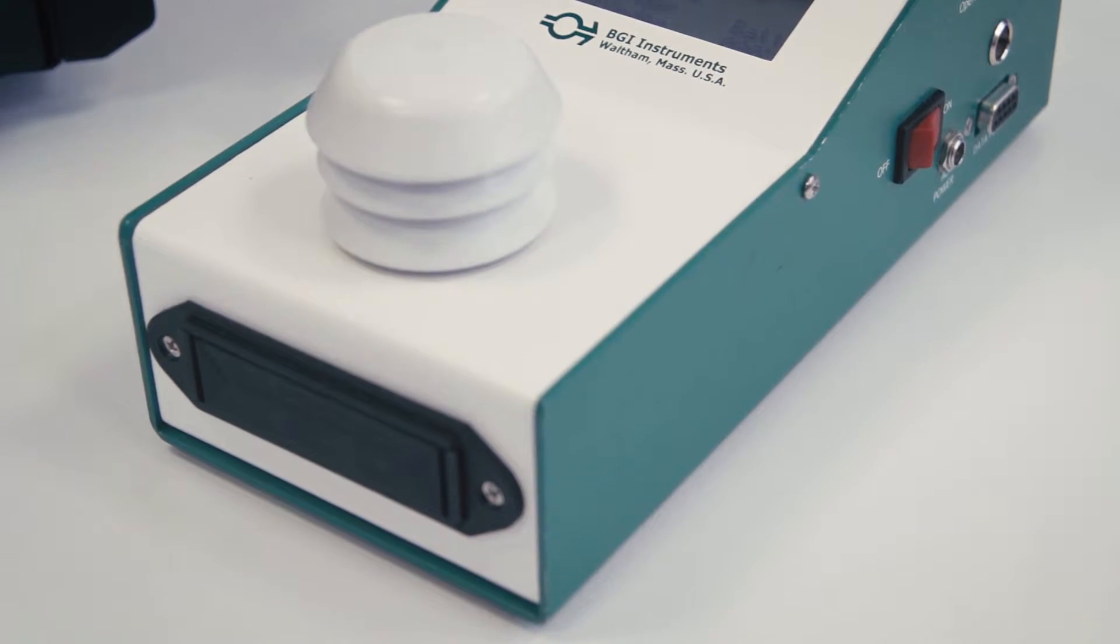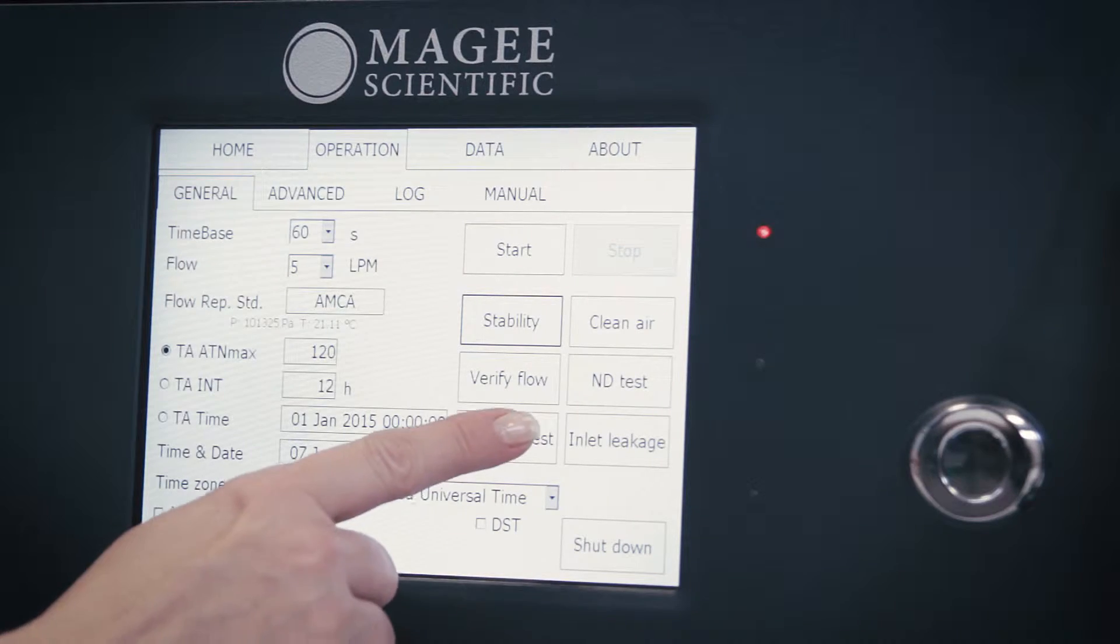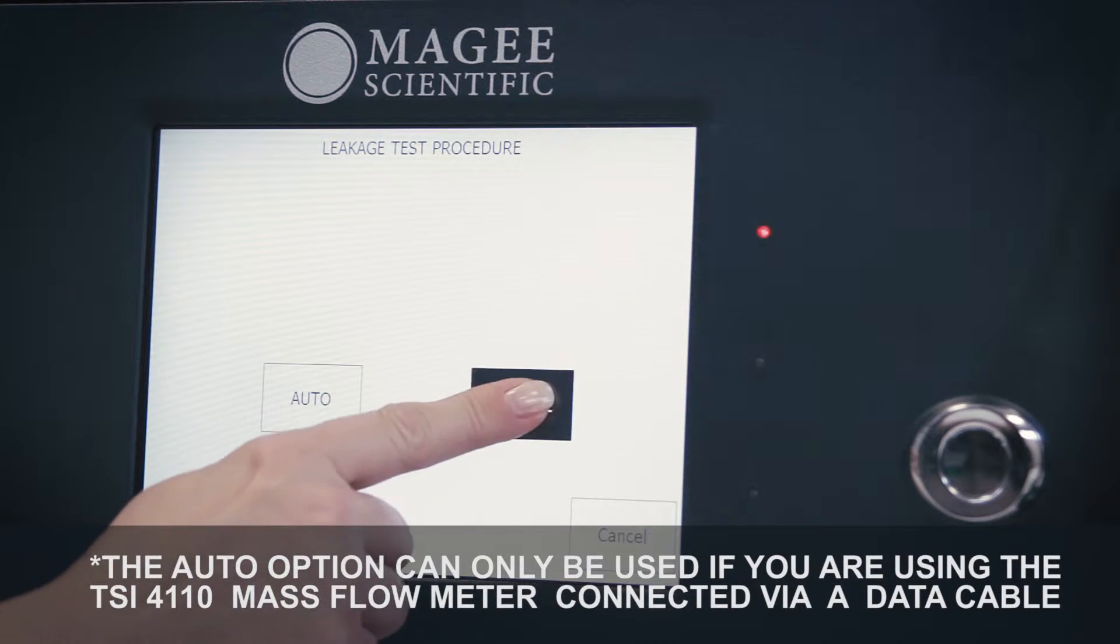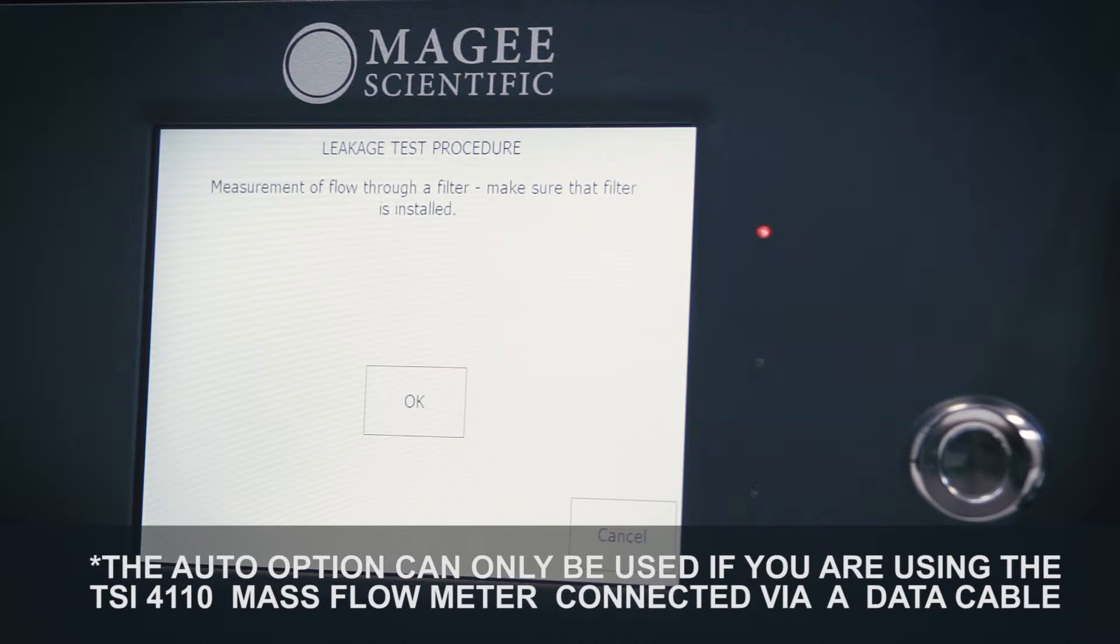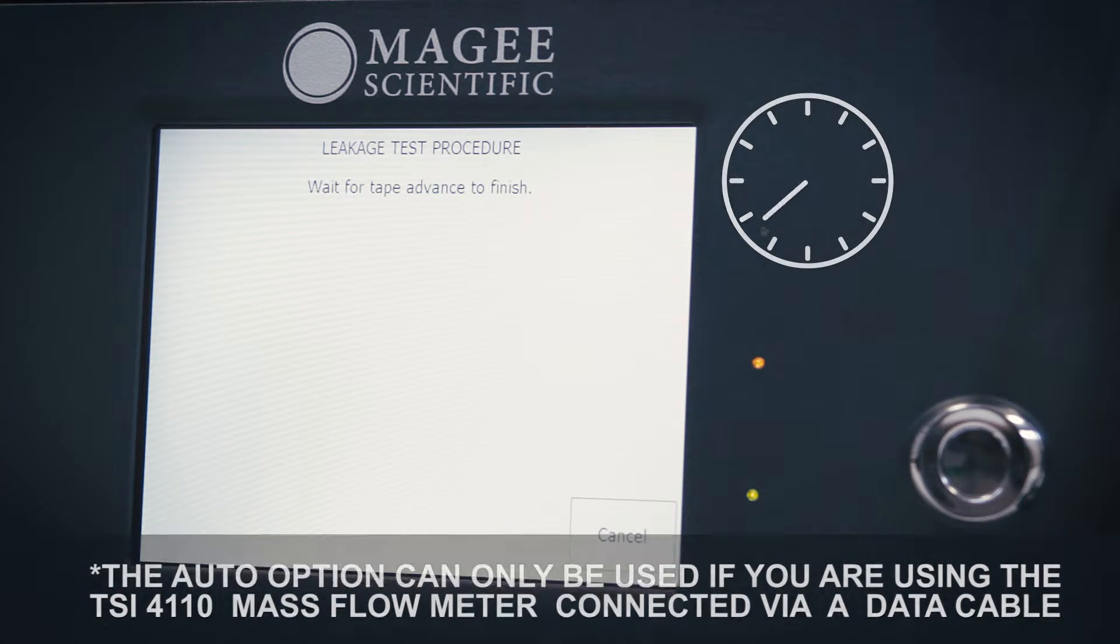Go to the Operation, General screen, and press the leakage test button to start the test. Choose Manual. Confirm by pressing the OK button. The instrument will first measure the flow through the filter tape.